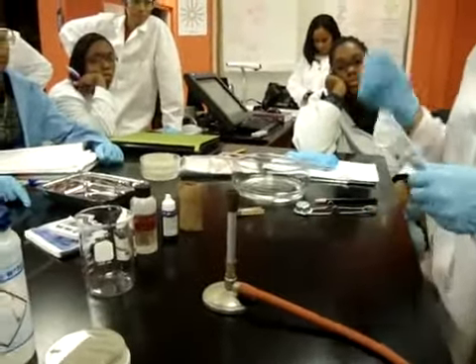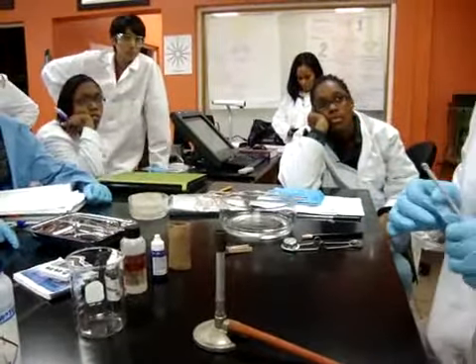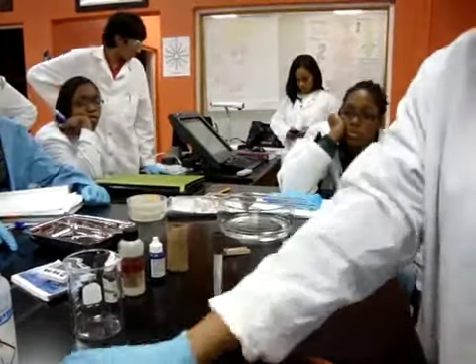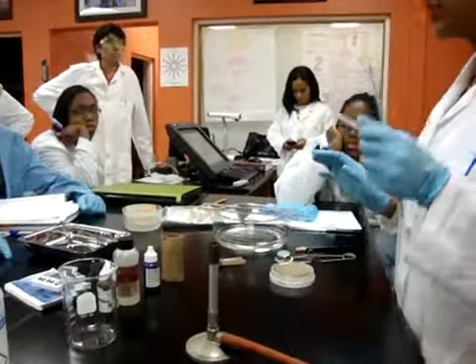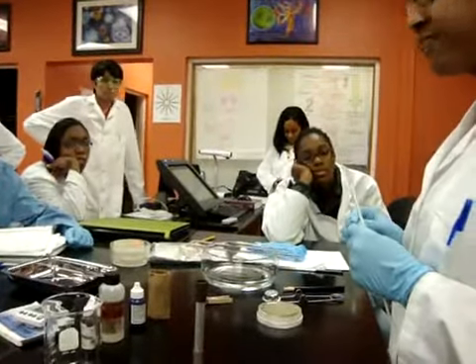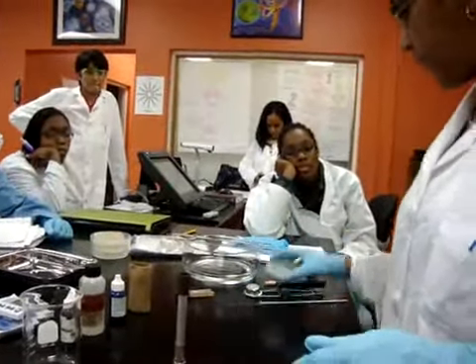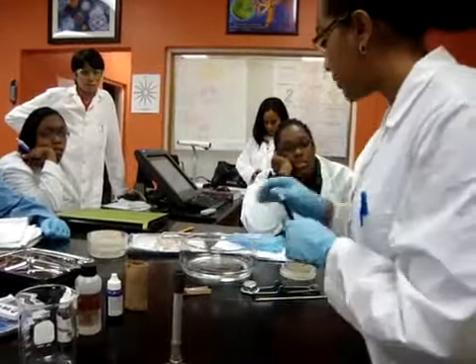Okay, so first thing you need to do is wash your slides with soap and water and make sure they're completely clean, especially oil-free. Wash them with soap and water and then make sure they're nice and dry. I'm just going to assume that this slide has been washed, but it hasn't. Let's start by lighting our burner. You also need a wax pencil.